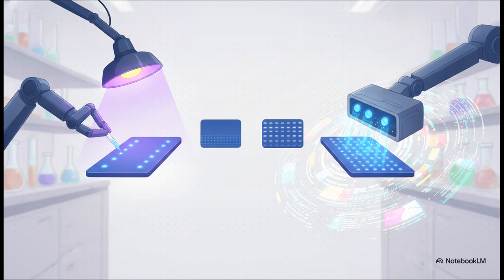Because the spots on an HPTLC plate are so incredibly tight, it opens the door to computerized densitometric scanning. Basically, we aren't just eyeballing the plate anymore to see if a spot is there. A computer actually scans the exact fluorescence of these bands and generates a hyper-precise digital fingerprint. It tells you not just what is in your mixture, but exactly how much of it is there. It turns a manual chemistry trick into an automated, quantitative powerhouse.